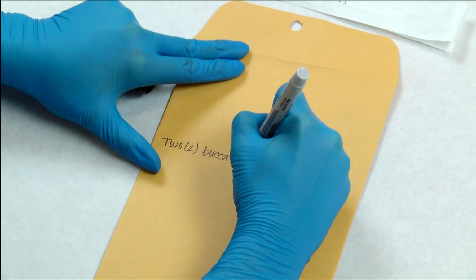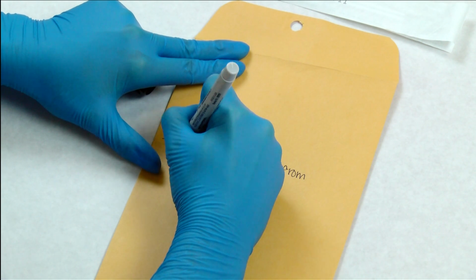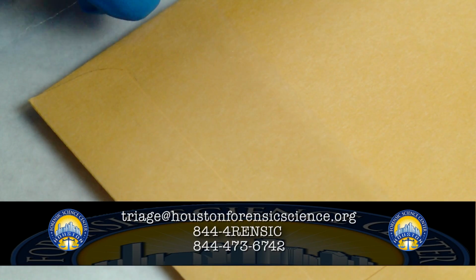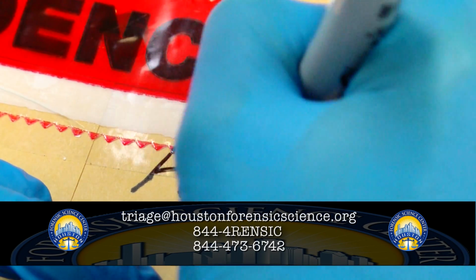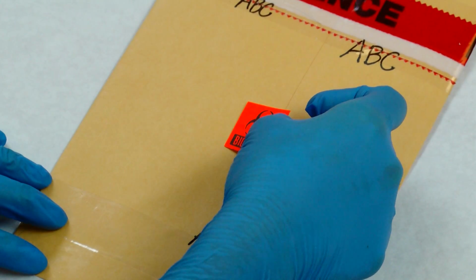Swabs should then be placed into a paper envelope with the outer labeling noting the number of the buccal swabs present. Identify to whom the swabs belong, and if the individual is a suspect, complainant, or elimination. After the physical evidence is carefully placed in an outer container, it can be sealed. The seal must have the initials or signature of the person sealing the evidence. Always put a biohazard sticker on DNA evidence.